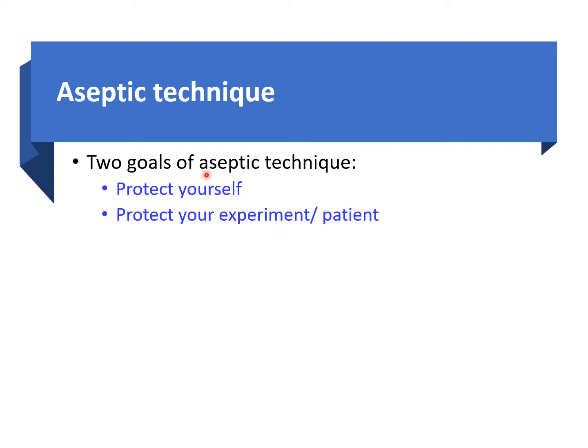By the way, if you break the word aseptic, septic means contamination, or basically sepsis. A means without, so without sepsis. So with aseptic technique, you are following rules that are going to prevent contamination, okay?